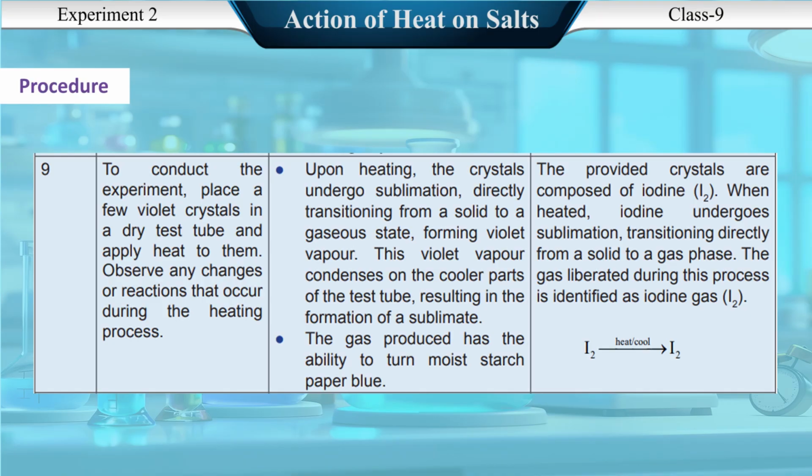The provided crystals are composed of iodine. When heated, iodine undergoes sublimation, transitioning directly from a solid to a gas phase. The gas liberated during this process is identified as iodine gas.